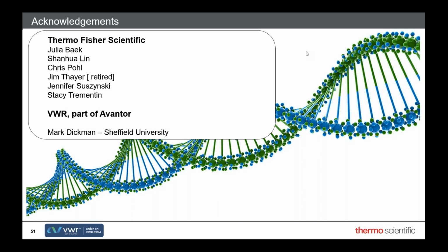So the other option is to treat the sample with something like pronase or proteinase K, get that protein all the way down and get rid of it, get it into small pieces, and then do that little bit of sample prep before you then go on to ion pair reverse phase. And then you've only got oligonucleotides to deal with.